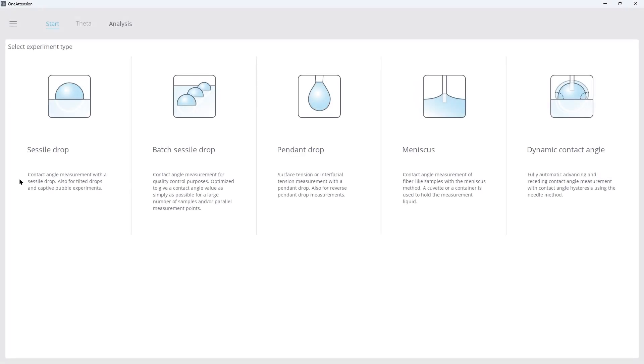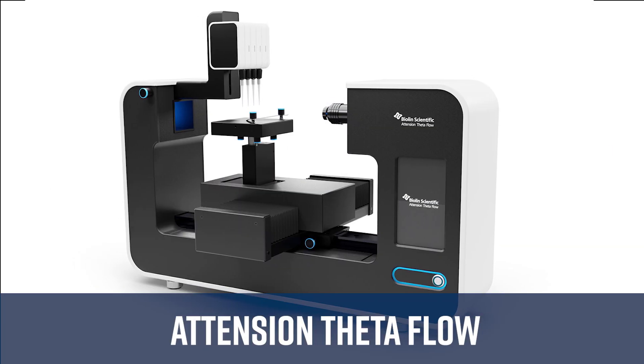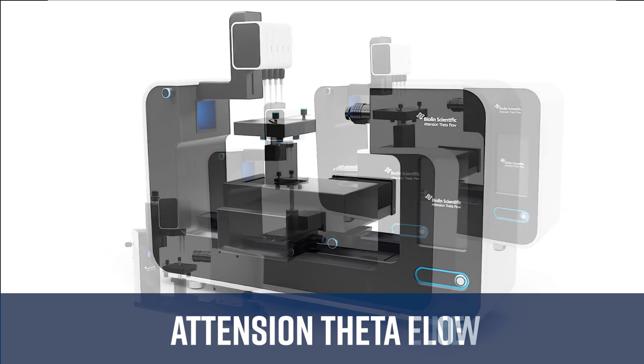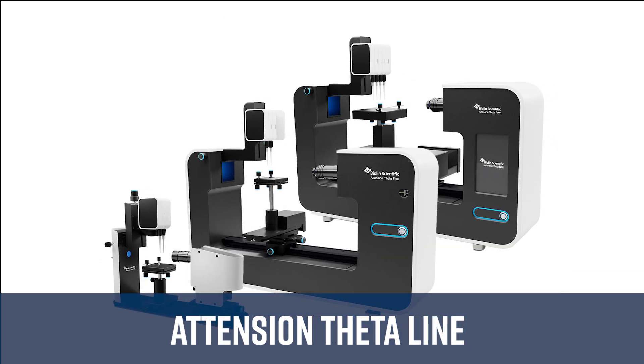Hello and welcome! In this video, I'll show you how to measure contact angles using the OneAttention software. I'm using the ThetaFlow, but this software is compatible with the entire attention line.